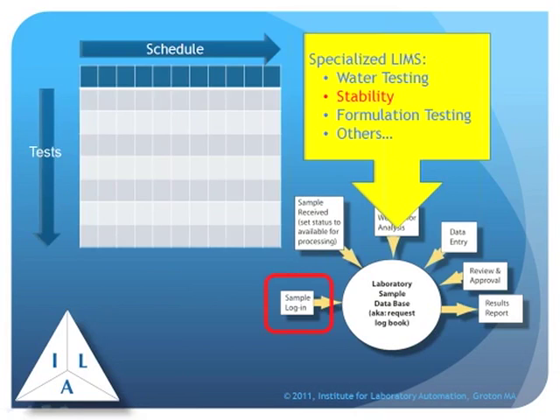When you do stability testing, you're looking to see how a product survives over a long period of time, basically determines shelf life. And it may be a matter of how long it actually sits on the shelf or how it stands up to weathering conditions and what happens to that product over a period of time. So in order to do that, you've got to set up a whole regime of testing. You have to expose a sample to whatever environmental or accelerated aging criteria you have, aging methods you have, and then periodically do testing. So you've got a range of samples becoming available at a certain time and a range of testing that has to be done in each one.